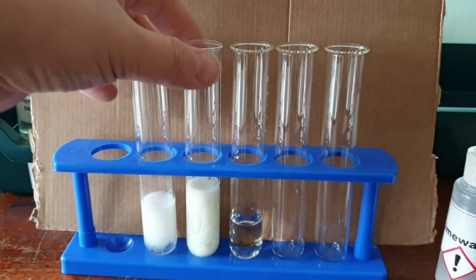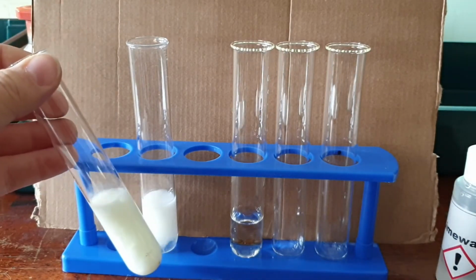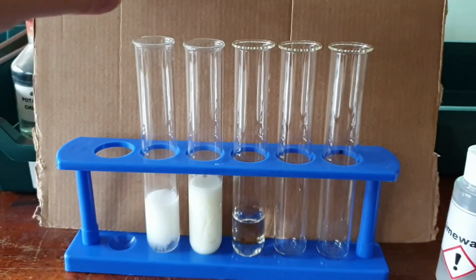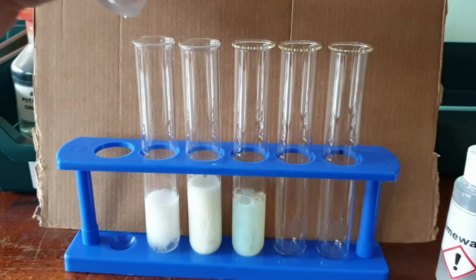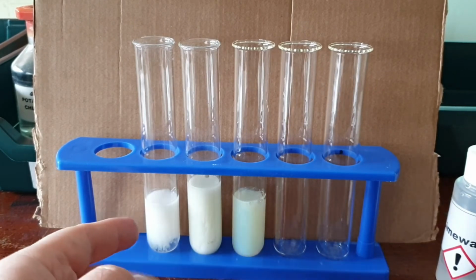Okay, sorry about that video. I'm not sure it's as obvious to you, but there's definitely a difference there, right? One of them's cream, one of them is white. And then silver iodide. So I'm going to add silver nitrate, nitric acid, and if there's iodide there, it forms a yellow precipitate. That's the example colours you need to know, right?